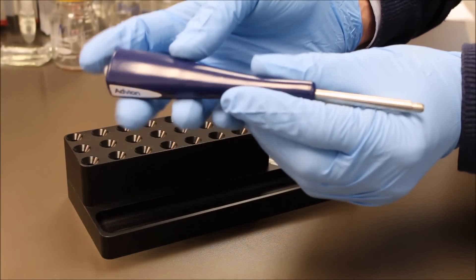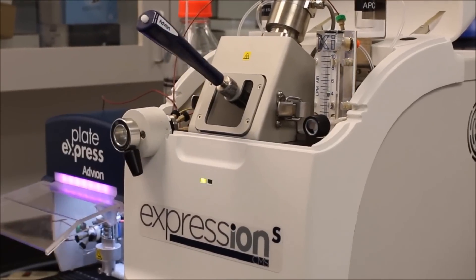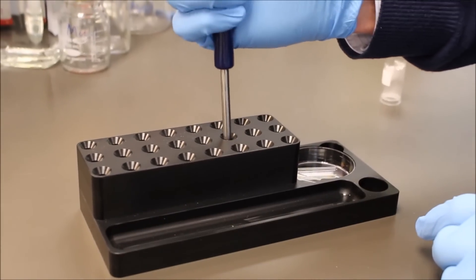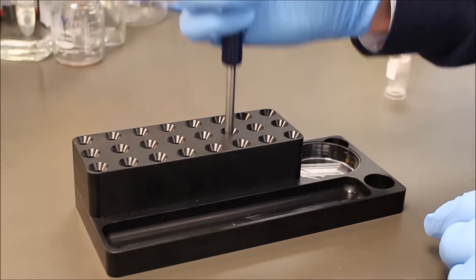The Atmospheric Solids Analysis Probe is one of the latest tools from Abiون that revolutionizes sample analysis. The ASAP is a probe developed to obtain mass analysis in less than 30 seconds.